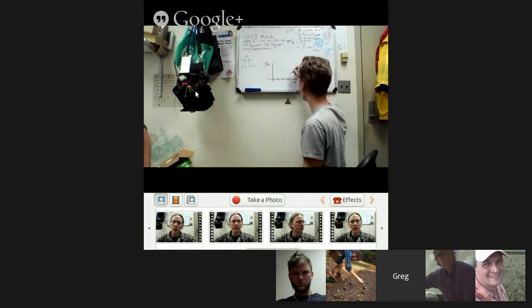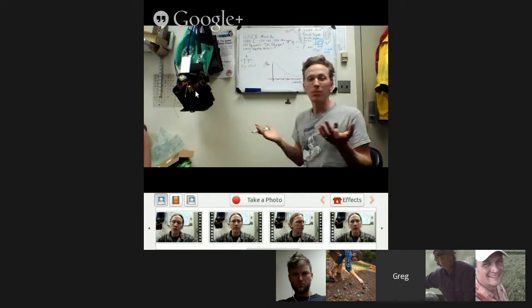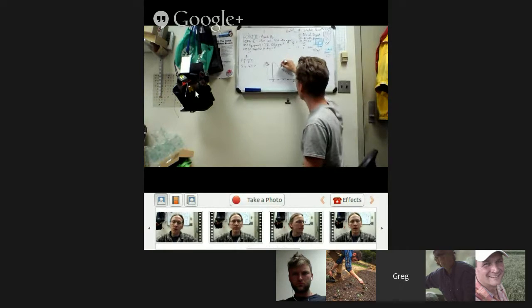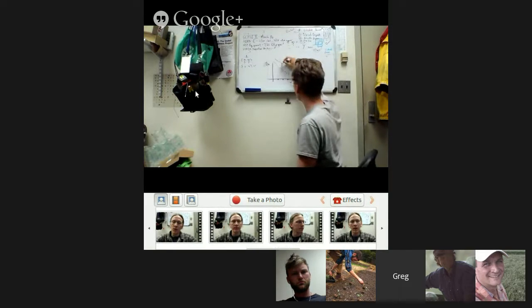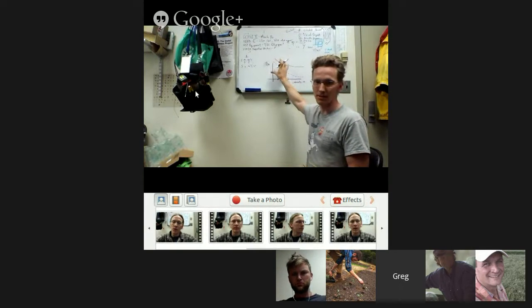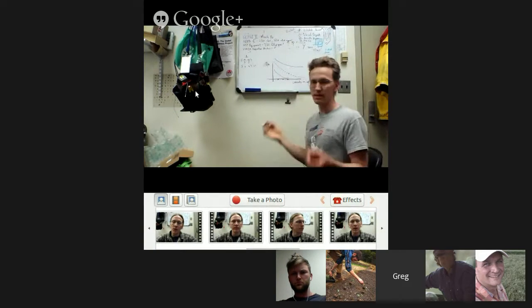So it's hard to know if you get a phi2 of 0.3, is that good or bad? Is it normal or not normal? Well, you just don't know. If you knew this entire curve for a plant at any given time, that would be very descriptive. You'd understand a plant that looks like this versus a plant that looks like this, that might be a health difference, or that might be a disease, or that might be a lack of water. But if you just give somebody one phi2 value, it doesn't tell you very much.